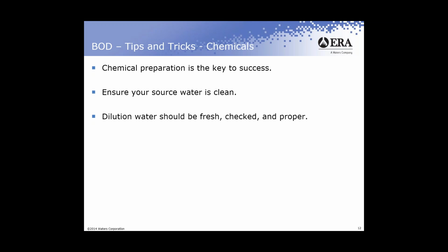Generally speaking, water is going to be somewhere between 7.5 and 8.5 or so, even up to 9, naturally, unless that water is really cold or you've got some kind of contamination in it, in which case you want to do something to rectify that. If your DO is too high, supersaturated, all you have to do is stir or shake it, which releases some of the air and should drop that DO back down into a good working range.